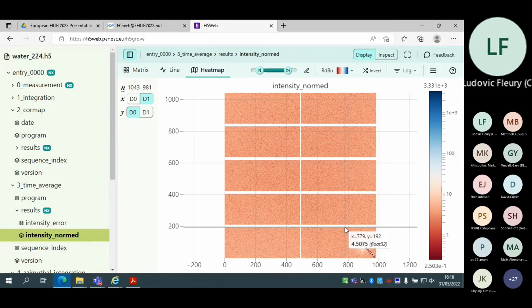Another feature that we added quite recently was a way to draw a rectangle to look at a particular place of the data. This is something that we didn't have at first, and we saw that it could be quite useful. And of course, it's not working because of demo effect.